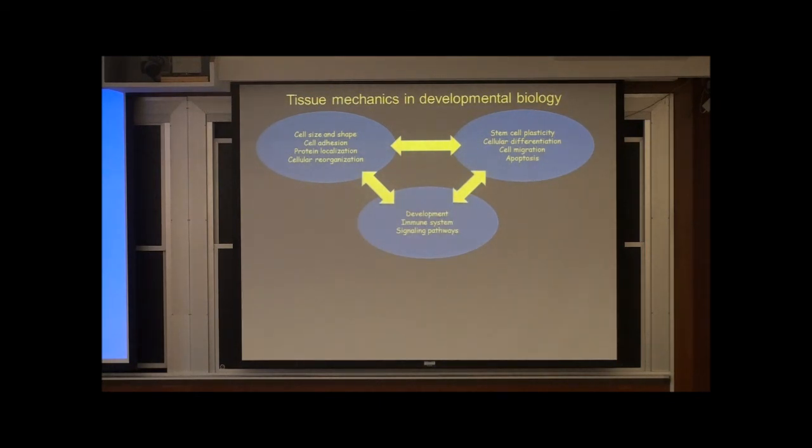So all these things are very interconnected, and ultimately if you have to understand how these things are happening in a developmental context, it is better to see them in the real animal model system in real time. To do this, I am imaging using a 3D fluorescent imaging approach, where I can see these developmental processes in real time in 3D, keeping embryos or fish anesthetized on the microscope for a really long time, several hours to even days.